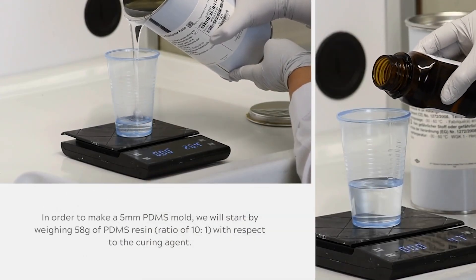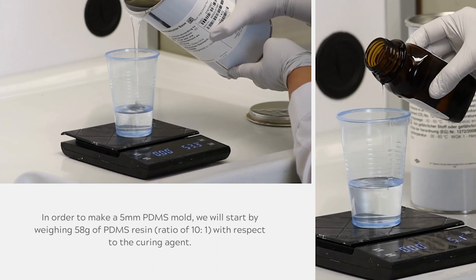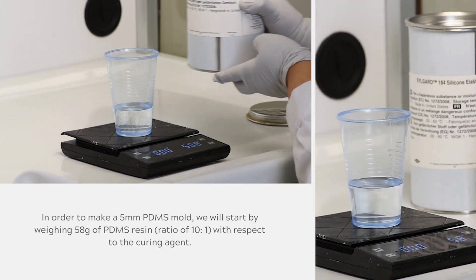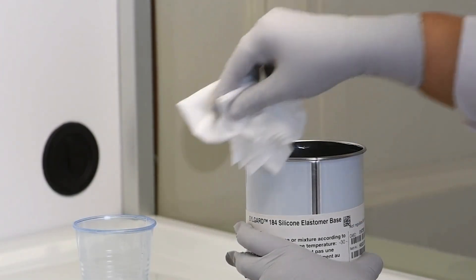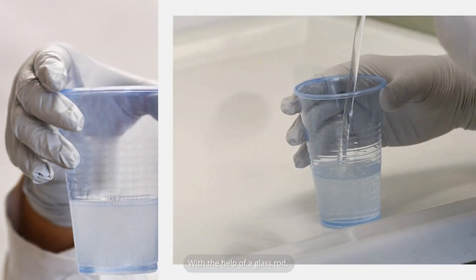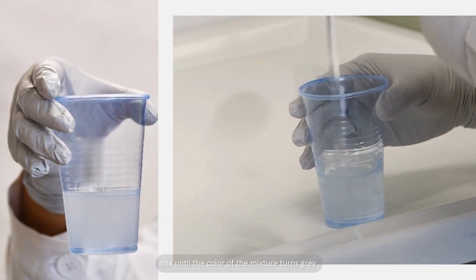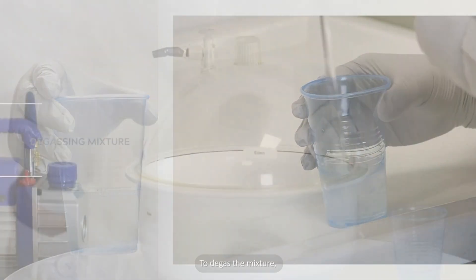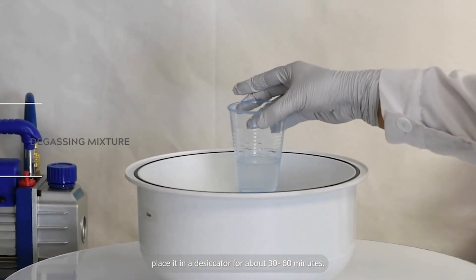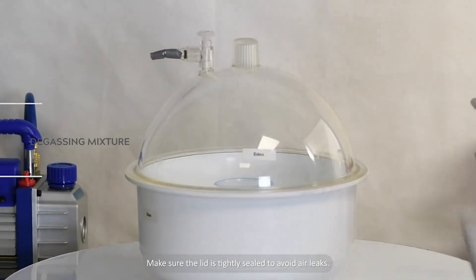In order to make a 5 mm PDMS mold, we will start by weighing 58 grams of PDMS resin, at a ratio of 10 to 1 with respect to the curing agent. Clean the ridges of the container once you finish weighing. With the help of a glass rod, mix until the color of the mixture turns gray and the texture becomes frothy. To degas the mixture, place it in a desiccator for about 30 to 60 minutes. Make sure the lid is tightly sealed to avoid air leaks.